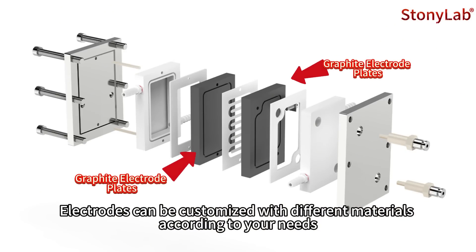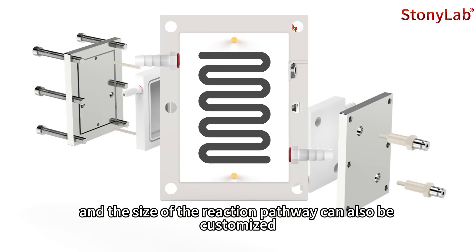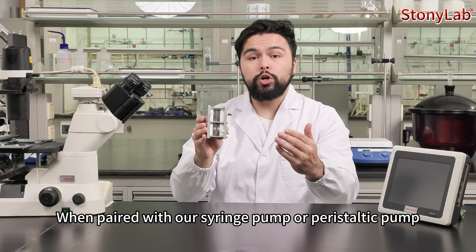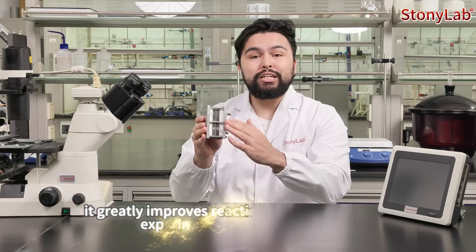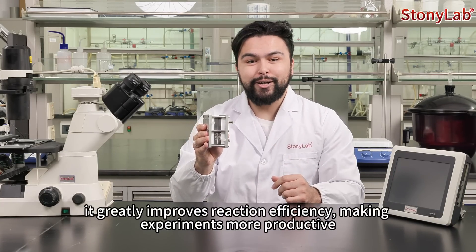Electrodes can be customized with different materials according to your needs, and the size of the reaction pathway can also be customized. When paired with our syringe pump or peristaltic pump, it greatly improves reaction efficiency, making experiments more productive.